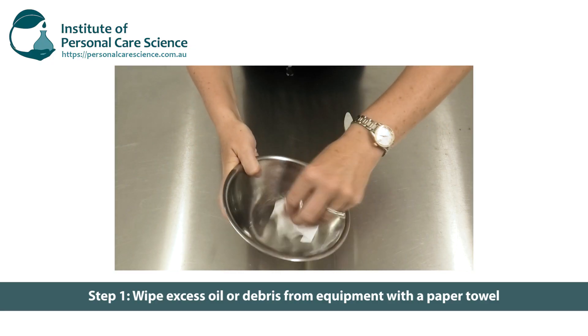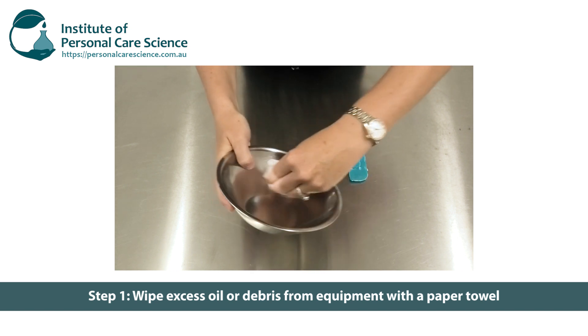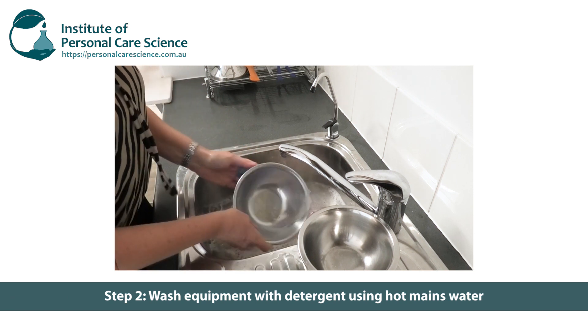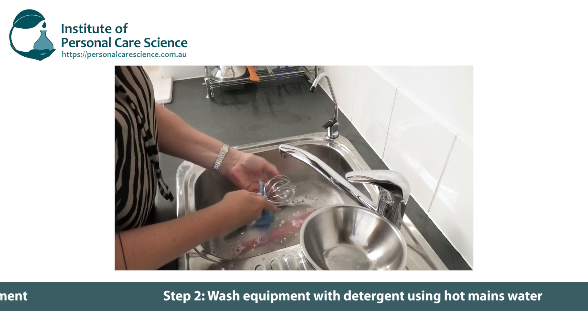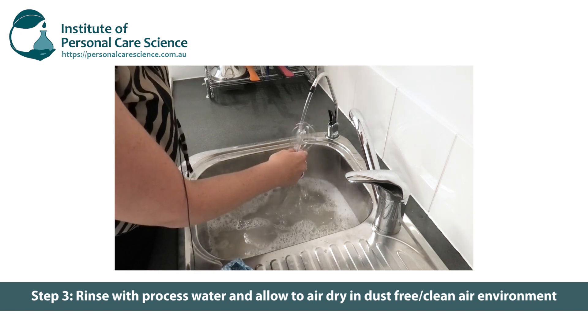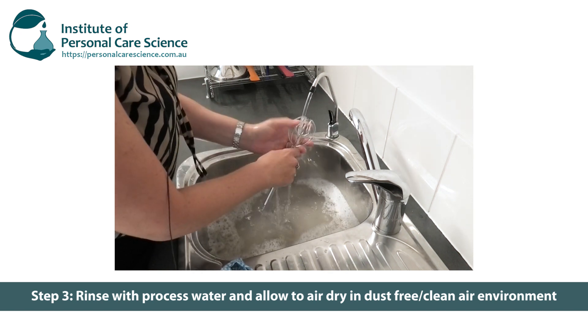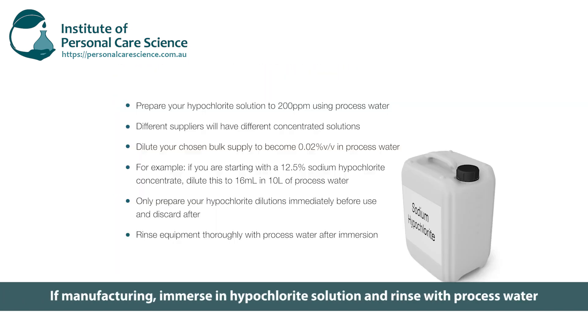So let me just run through those steps again. Step one: remove any excess oil or debris using paper towel or similar before you get to the washing step. Step two: wash the equipment thoroughly with hot soapy water — detergent is fine at this stage and use mains water. Step three: rinse with process water. If you're just working with your lab equipment, allow it to air dry in a clean environment. If you're manufacturing, follow with a hypochlorite immersion, then rinse with process water again before allowing it to air dry in a dust-free clean environment.